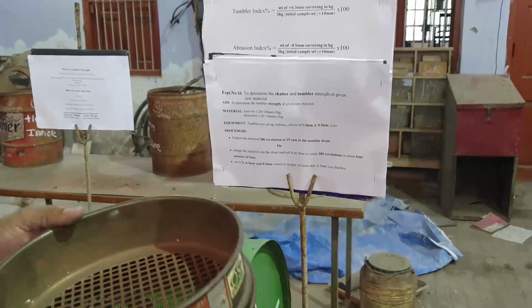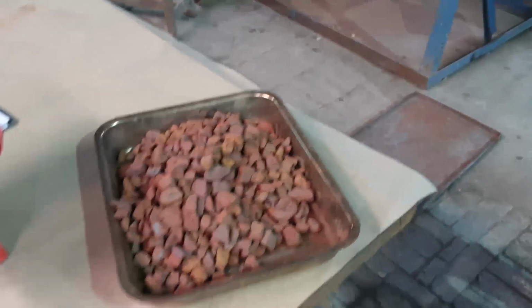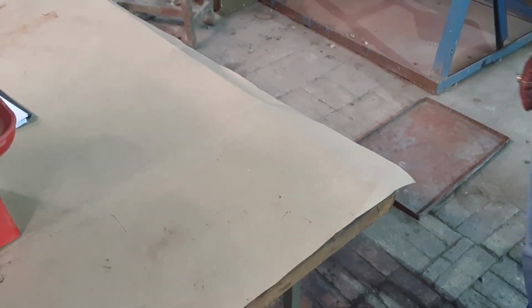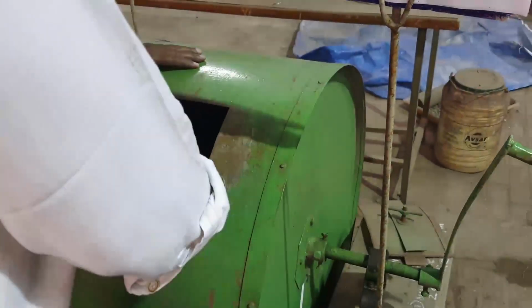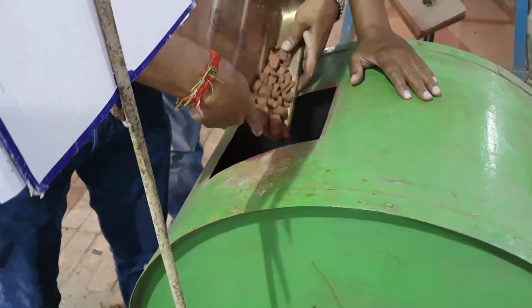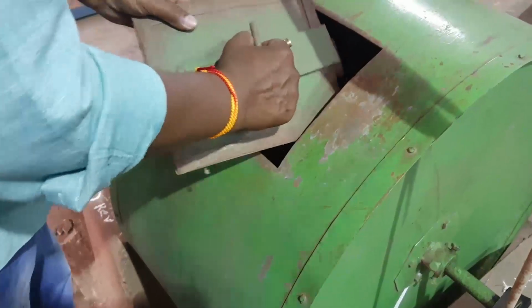Now we will start the practical. So 5 kg iron ore, we are taking this one, minus 20 plus 10. It is already weighed. We are putting it into the drum. Closing the drum.